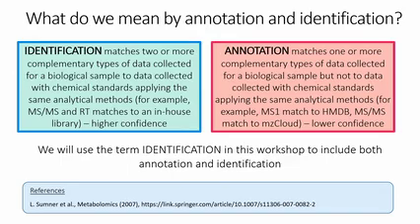Identification, you're typically comparing two or more complementary types of data to data that's been collected for an authentic chemical standard, and that data's been collected in your laboratory applying the same assays that you apply. That's identification. So, for example, you're using chromatographic retention time data and MSMS data, and you've run an authentic chemical standard and compared the retention time and the MSMS spectrum for the chemical standard and in your biological sample, and you're getting a match under certain criteria. So that's high quality, high confidence.